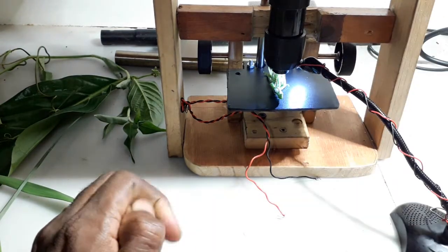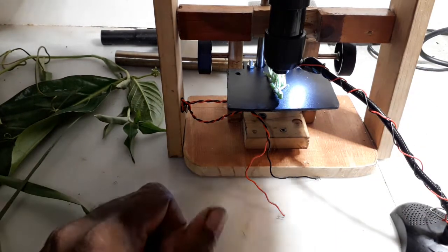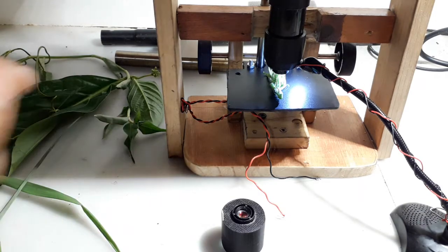I have the light. Now I'm going to change and place this lens upstairs. I'm going to remove this, place this, and now I'm going to come up with the camera, and I'll be doing some searching. Let's see if I can find the job. I'm going to pull this stuff a little closer to me. See if I can find this stuff. Oh, that's not where it is. So where is the camera? Oh, I placed this wrong. Wait a minute. So that's where it is.